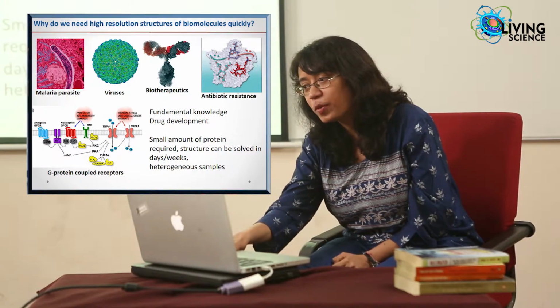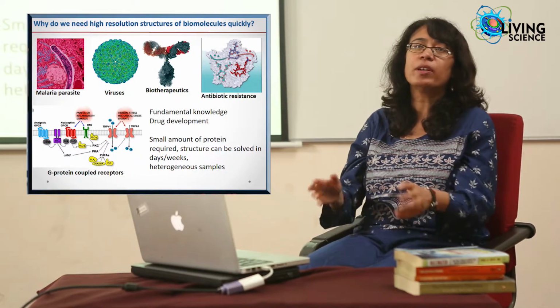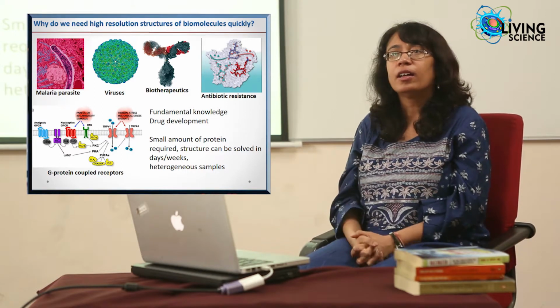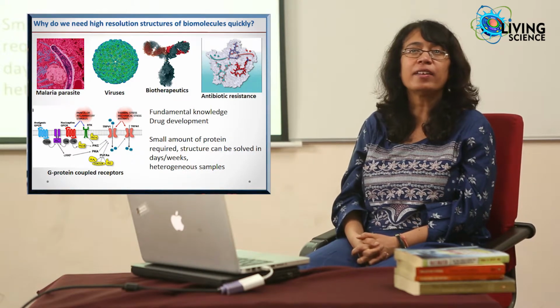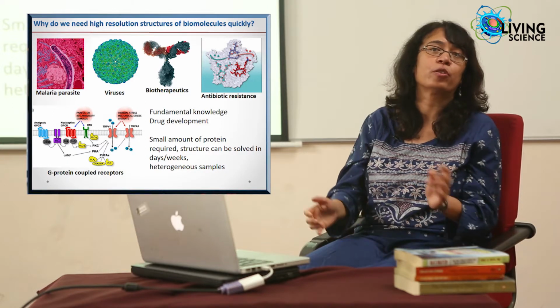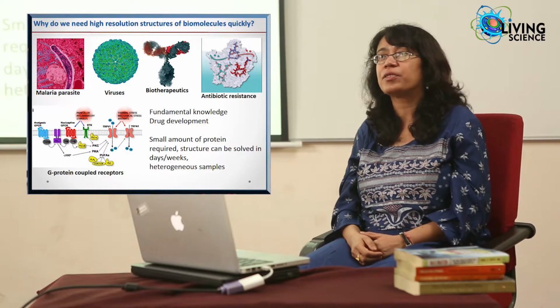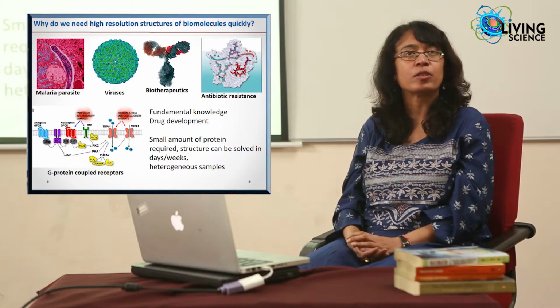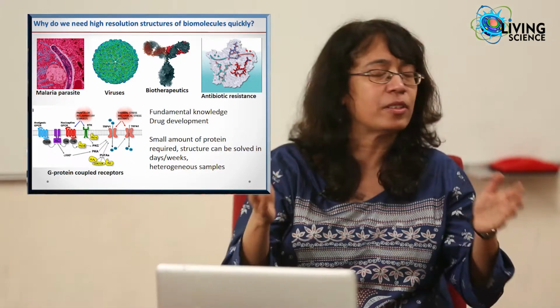So here the question is again, what is the advantage of this? We've talked about a technique which would provide high resolution structures of biological macromolecules. Why is that necessary? Why should anybody care? Why can't we just go with X-ray crystallography, which is a very well-defined method? The reason is that we relate biological structures to function.